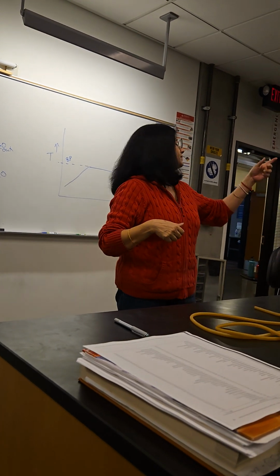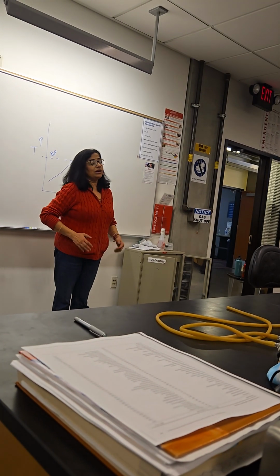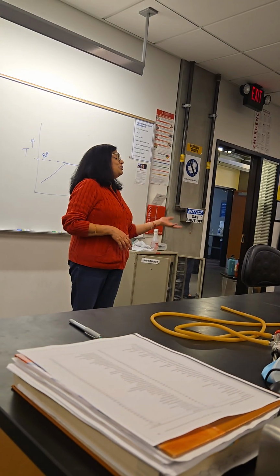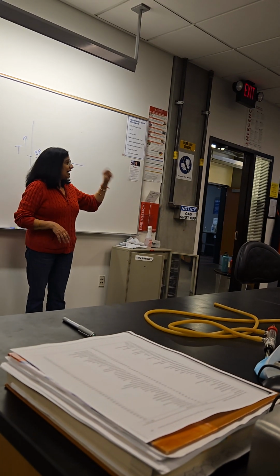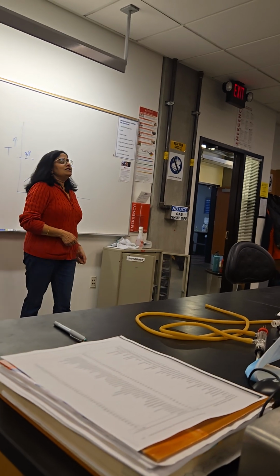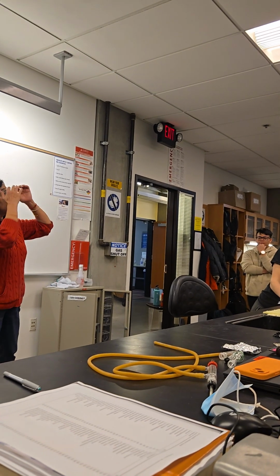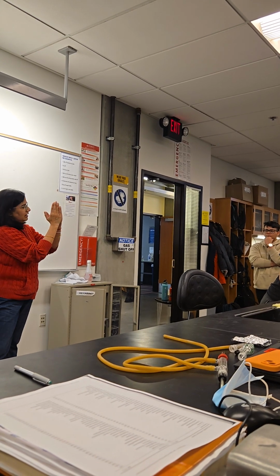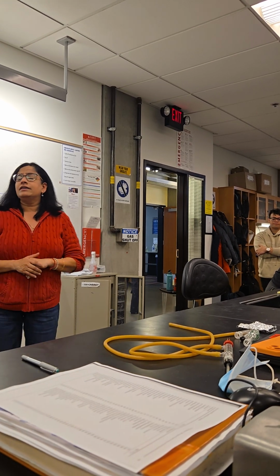Yes? I was just going to say, what heat would you recommend to put the hot plate on? That's a very hard question for me to answer, Gavin. I wish there were a better answer, because the hot plates are, again, not calibrated. Ideally speaking, if I were the queen of the world, the first lab day would be calibrate your hot plates, calibrate your thermometers. But I'm not queen. So, hard question for me to answer. My suggestion would be, because we don't know the boiling point, maybe start in the middle. And then if it's taking too long, then increase it. If it's taking way too long, just crank it. Make sense? Anything else, guys?